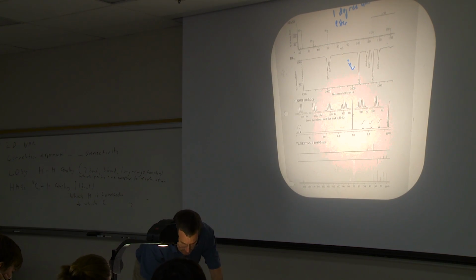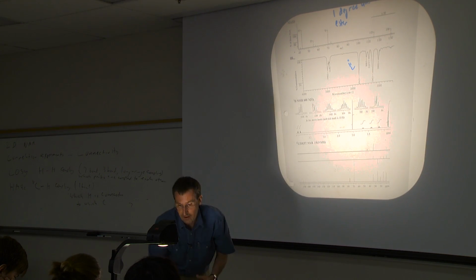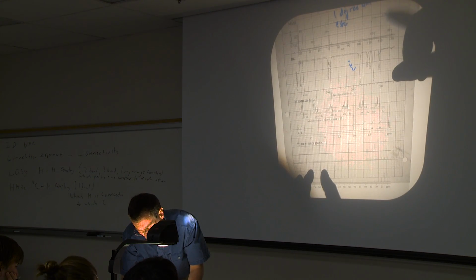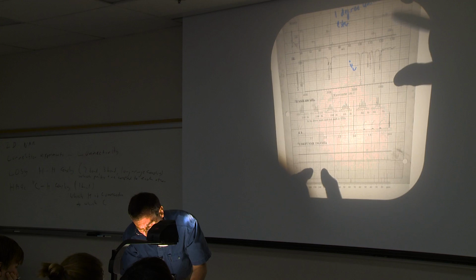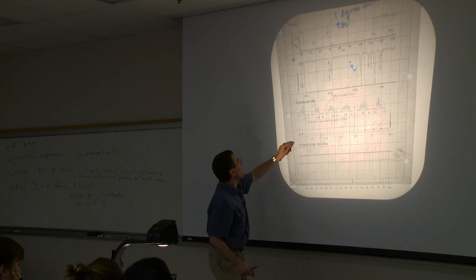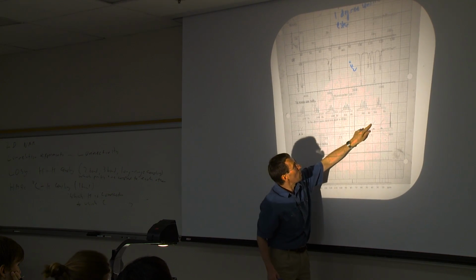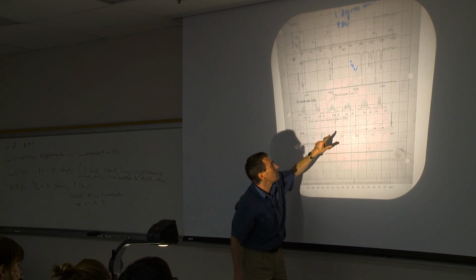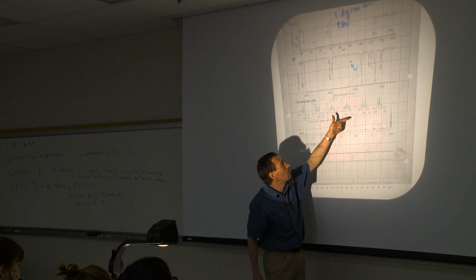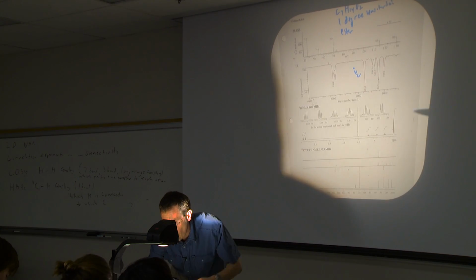If I continue with my inspection of the spectrum, generally I'll stick a ruler or a grid on, and I can measure. I got about 1.7 or 1.8 for all of these, in other words, probably about 1.8 per hydrogen. I got maybe 5.2 over here and maybe 10.6 over here.